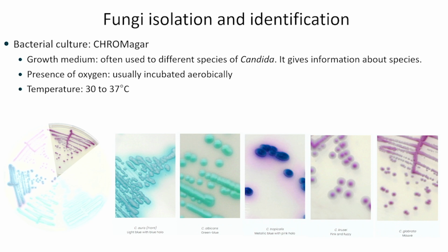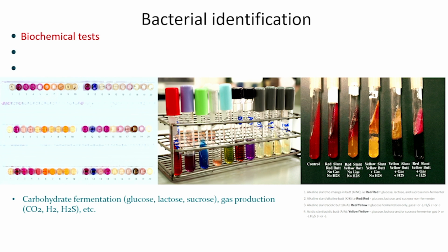For bacteria, like I mentioned before, we need to grow them, and we have a few pieces of information: they are gram-negative or gram-positive, they grew orange in the agar, or they grew pink in the agar, so they might be Escherichia coli, they might be Klebsiella, but I cannot tell yet for sure. I need to do more. So what can we do in the lab in order to identify these microbes? So far, I'm only walking you through the clinical part. I didn't even start what we do for research, right? We are trying to isolate specific disruptors of the small bowel. So then what we do is biochemical tests.